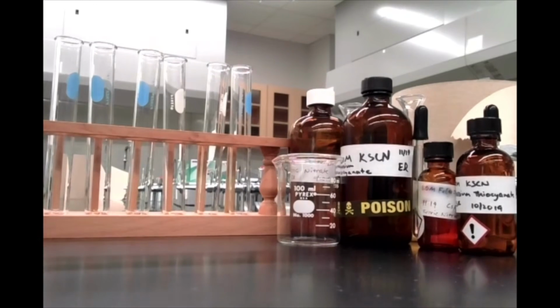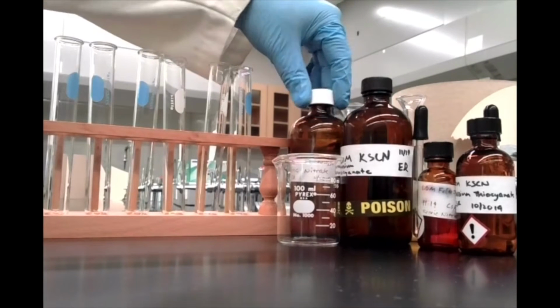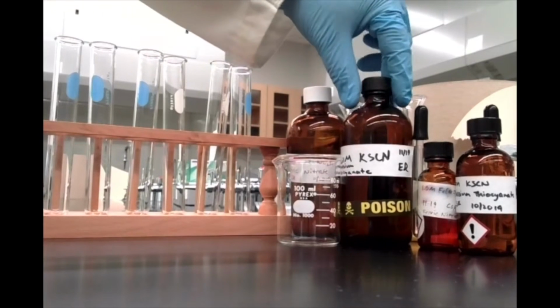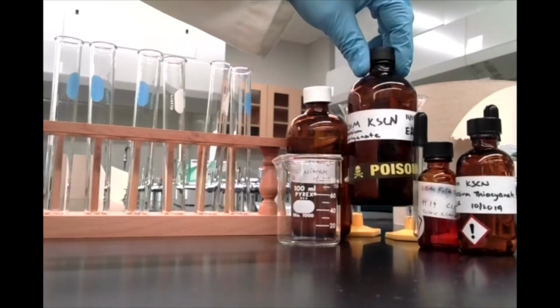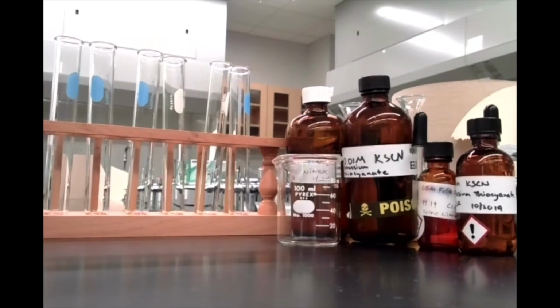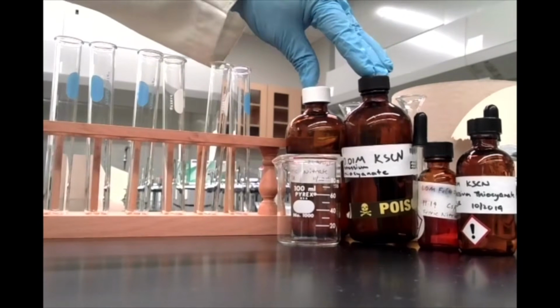We're going to take iron 3 plus ions from our iron 3 nitrate, also commonly known as ferric nitrate, and react it with potassium thiocyanate. So the thiocyanate ions in our solution are going to form a complex with the iron 3 plus ions. Now, we've seen this reaction multiple times before. If you recall, you'll get this sort of dark reddish color from the complex that's formed. Now, this dark red complex exists in equilibrium with the original ions separate here.